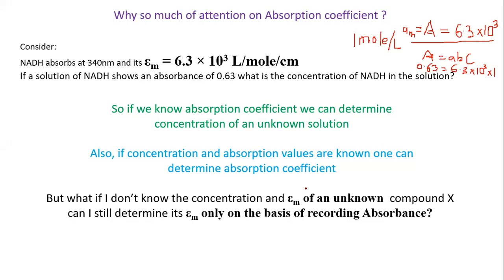Range of absorbance means what? So range of absorbance, like we are taking the readings, no? Like DNA absorbs at a specific wavelength. So I'm trying to say that we can use that absorbance to identify that compound. Are you trying to say that because DNA absorbs at 260, anything that absorbs at 260 becomes DNA? No, sir. I am not saying it's specific. I'm just saying we can try it. Okay, then try it. If I tell you that compound X absorbs at 340 nanometers, does that make compound X NADH?